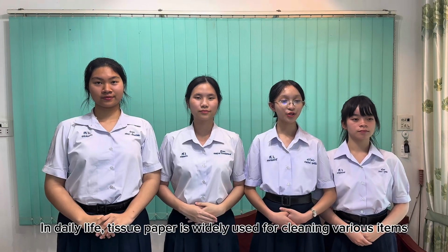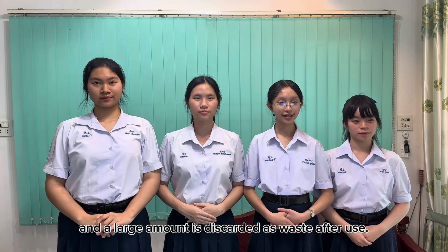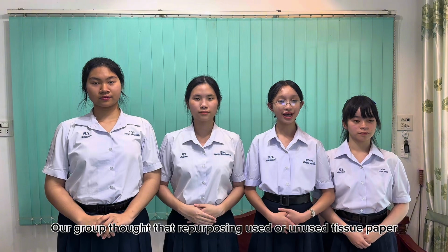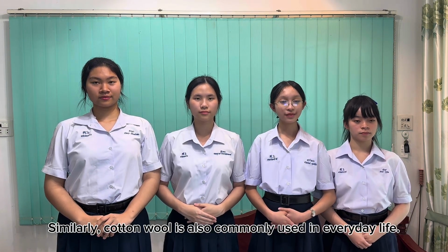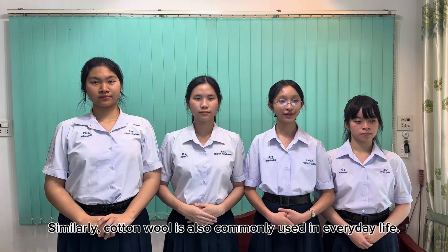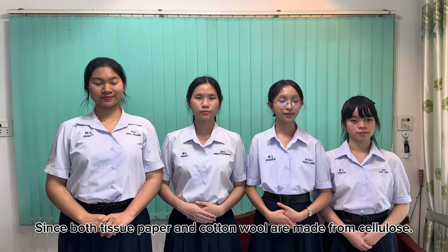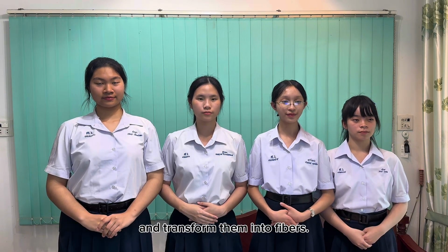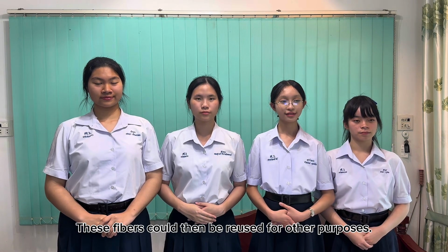In daily life, tissue paper is widely used for cleaning various items, and a large amount is discarded as waste after use. Our group thought that repurposing used or unused tissue paper to make it useful again would help reduce waste. Similarly, cotton wool is also commonly used in everyday life. Since both tissue paper and cotton wools are made from cellulose, our group came up with the idea to take these discarded materials and transform them into fibers.